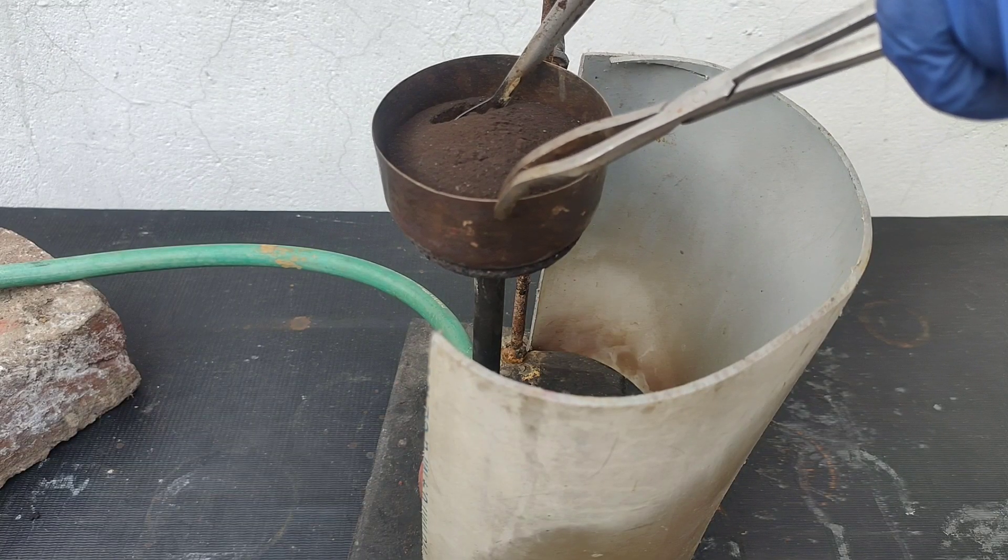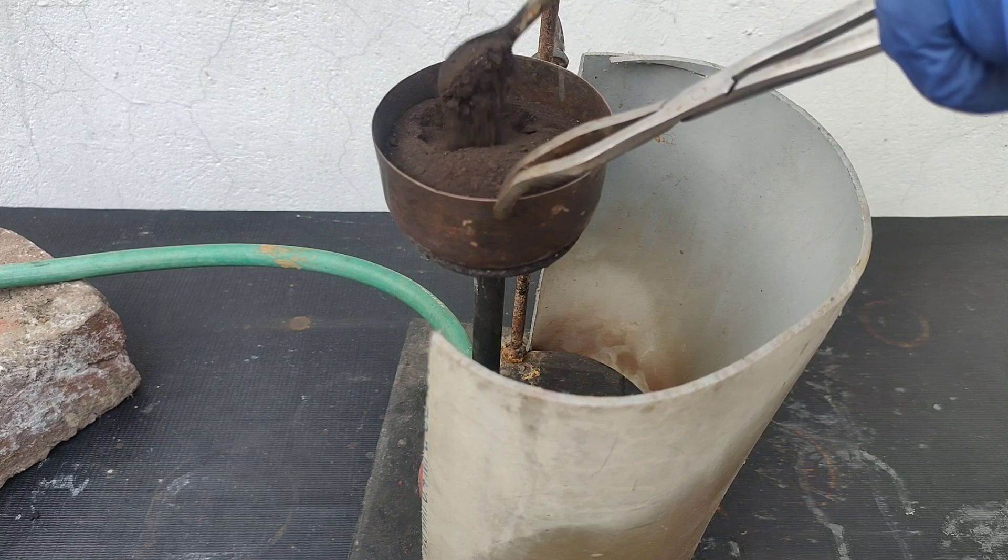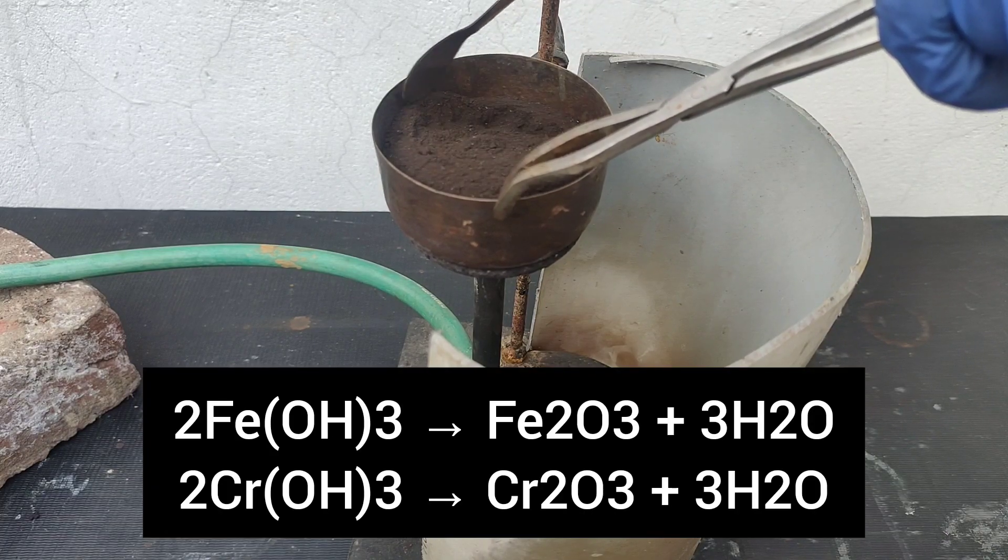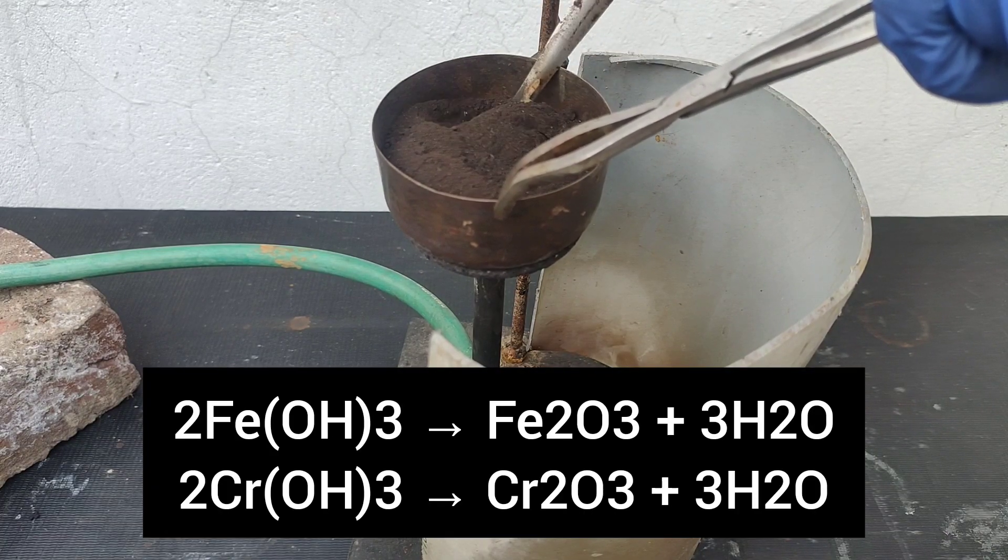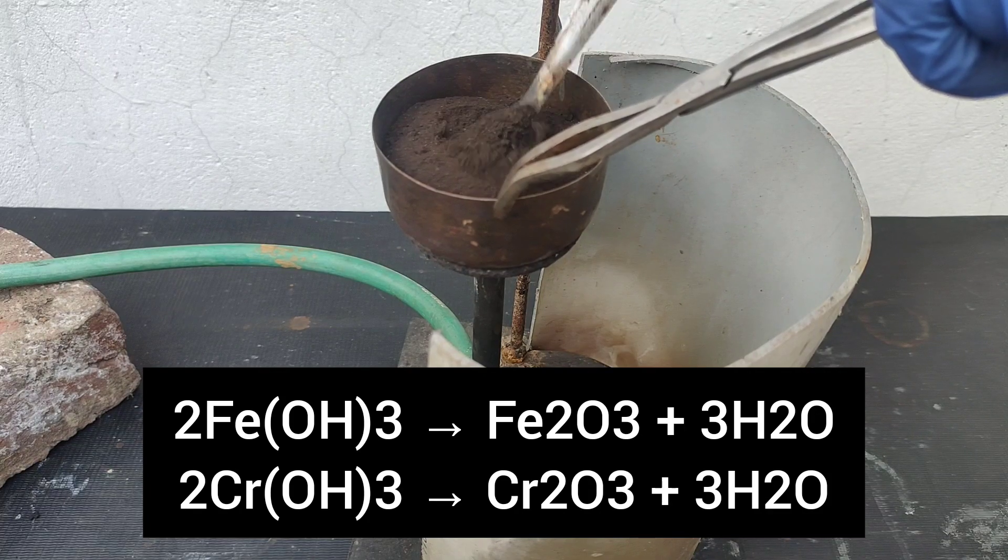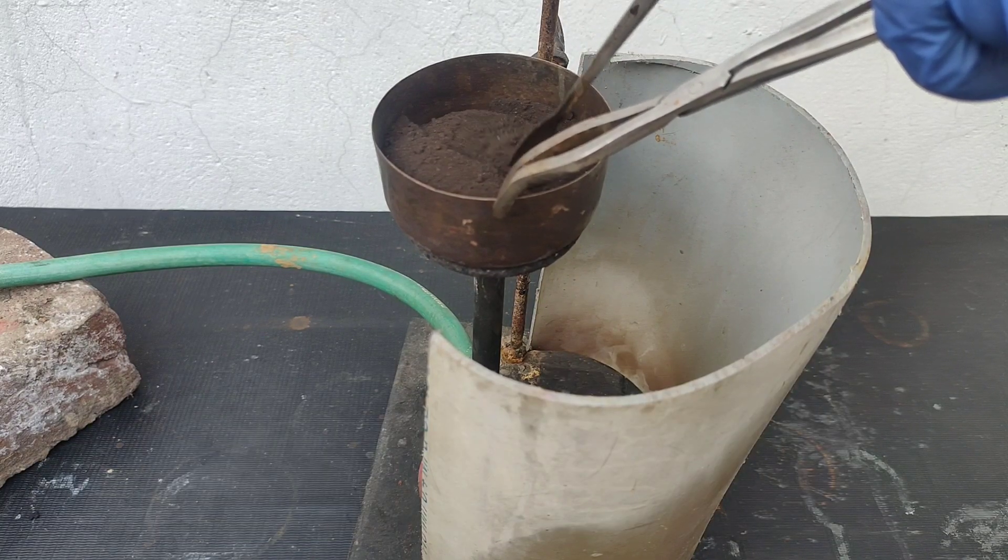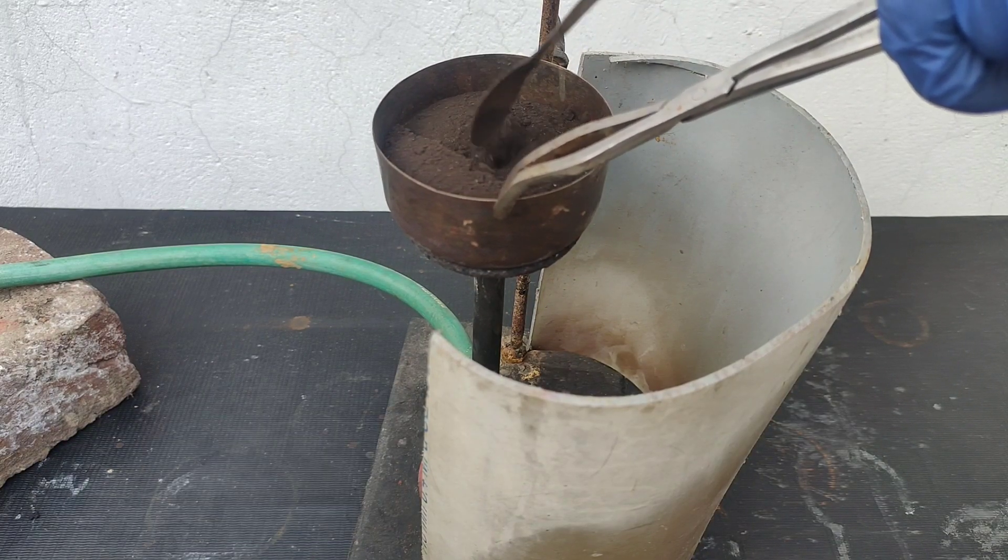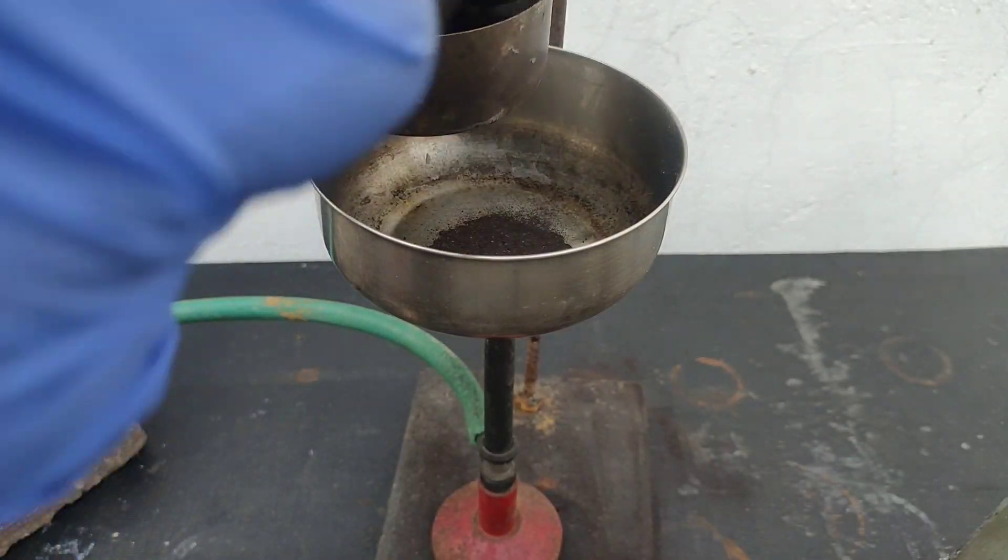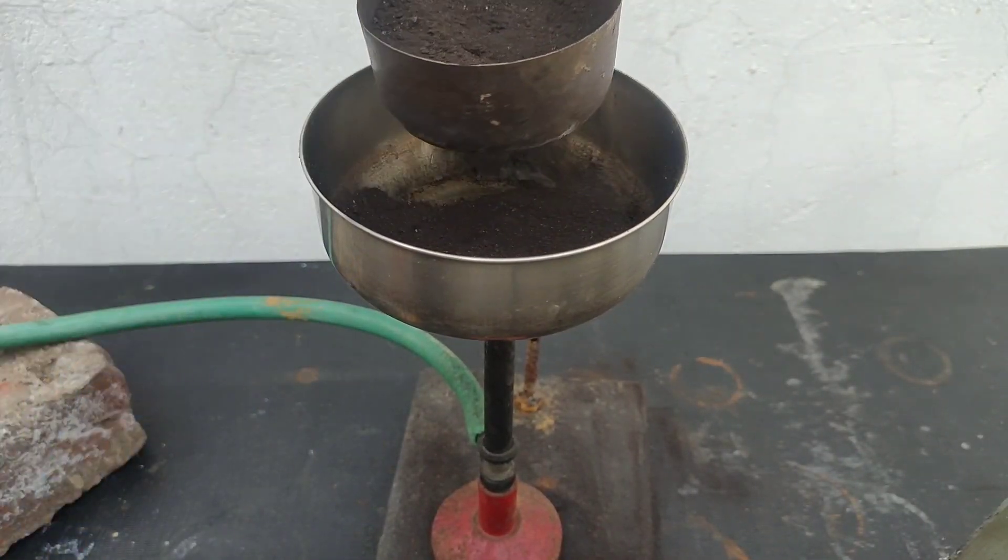I will be heating the powder on a Bunsen burner and stir it with a spatula. First the hydroxide will be converted into oxides. But I realized that the bowl was too small for this, so I transferred the powder into a bigger bowl and started heating.